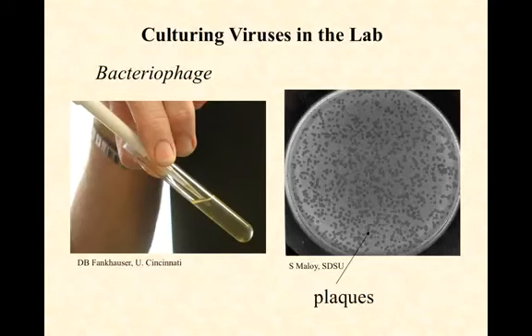All right, before we leave behind some of the basics of viruses, we want to take a quick look at how viruses are cultured in the lab. It is a bit different from how we culture bacteria in the lab. Let's start with bacteriophage. These are the easiest viruses to cultivate in the lab.